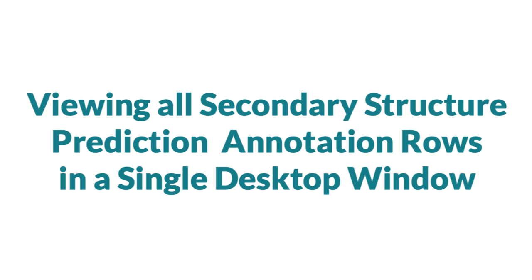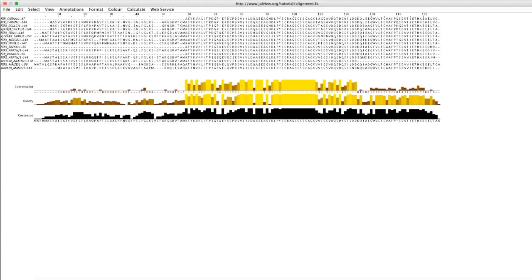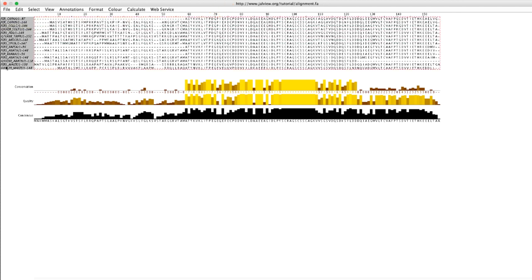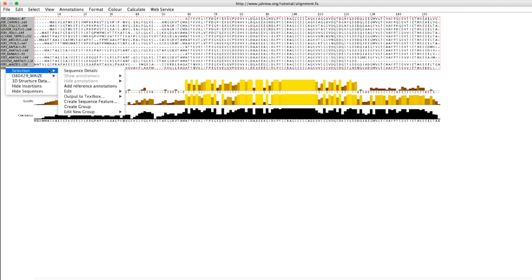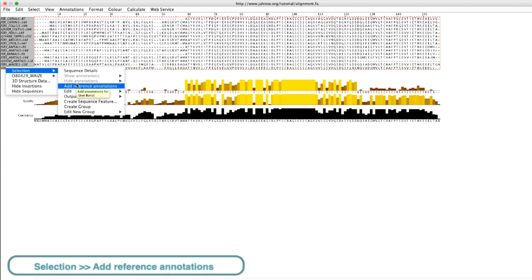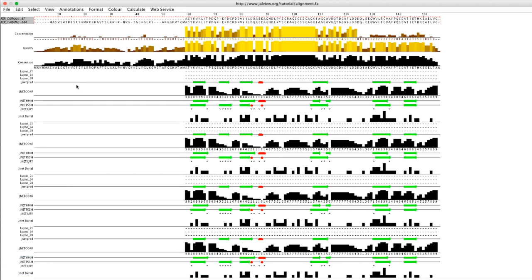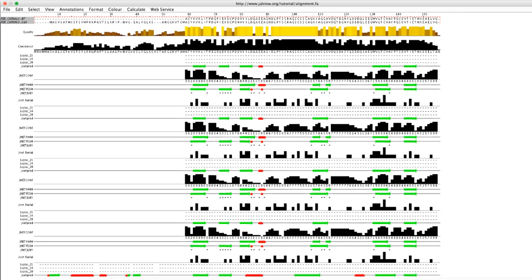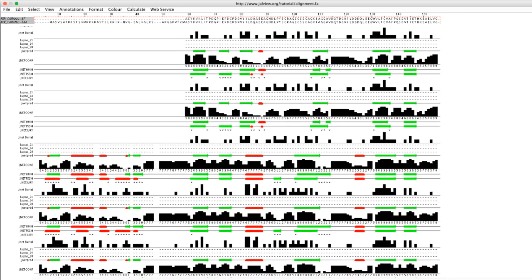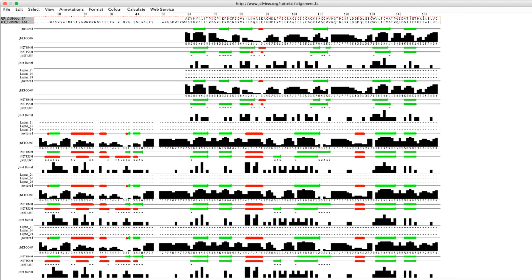I can view all the predictions in the original alignment window. First I go to the original alignment, select all the sequences, then right click the mouse to open the context menu. Go to selection and select the add reference annotation option. All the JPRED prediction results for the sequences are now visible in the original alignment.